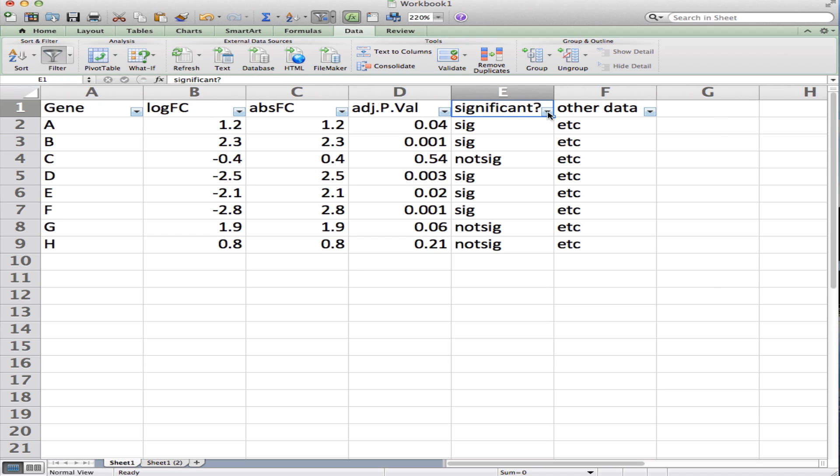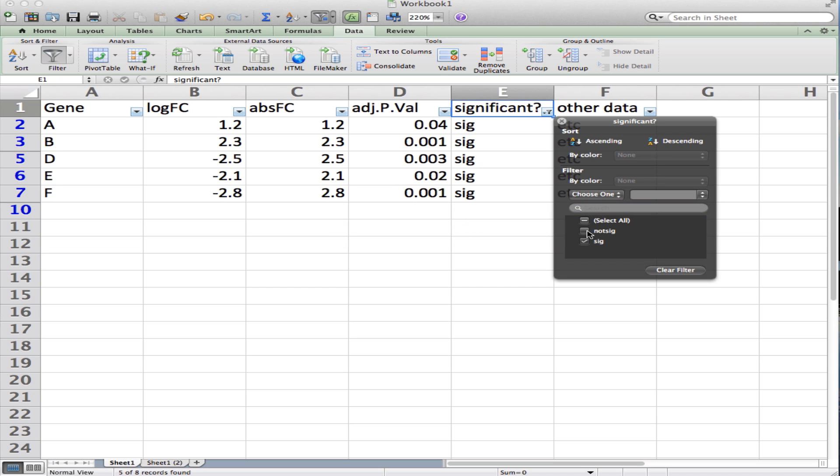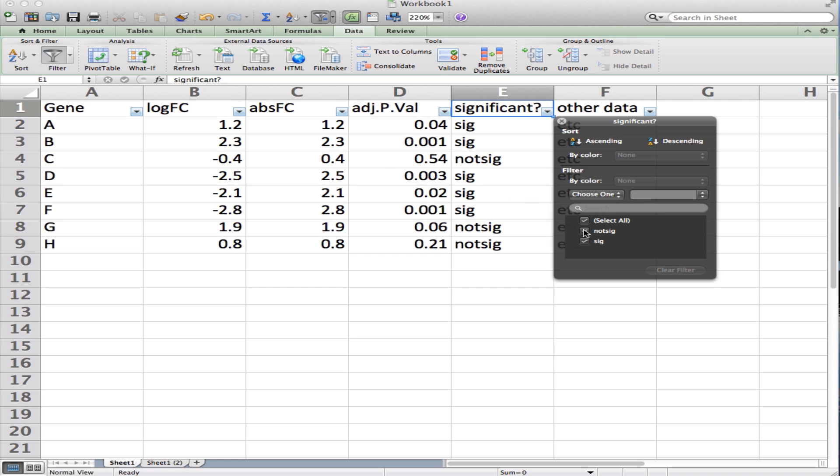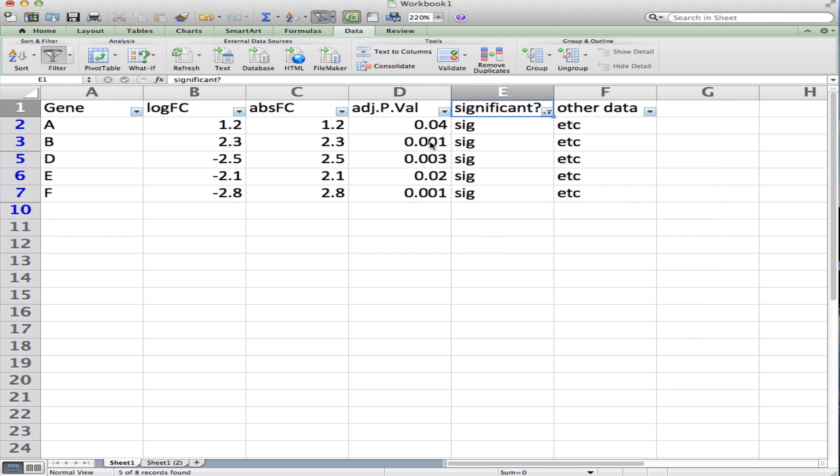So here if I click that, I say I only want to see significant, not 'not significant,' so I'll uncheck that box and all the not significant hits go away. Now I'm only showing the hits that are significant at 0.05 or less.